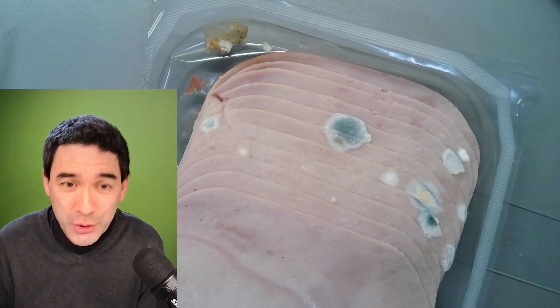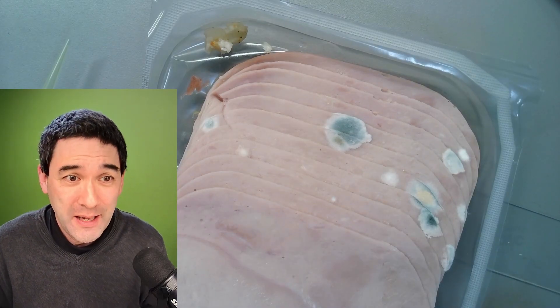How can this even happen to me? Even to me? Well, we simply overlooked it. Somewhere on the very back in the fridge, this is basically what I found.